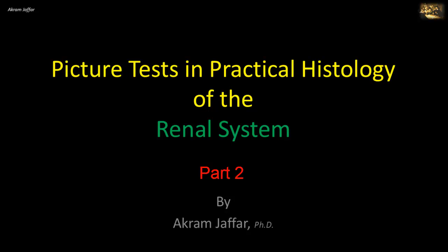This is a picture test in practical histology of the renal system. You may use the video as a revision for the topic or as a self-assessment tool. For the purpose of self-assessment, pause the video at the beginning of each slide and take your time in reading the question and coming up with the answer. Then replay the video to confirm your answer and listen to further comments and explanations.